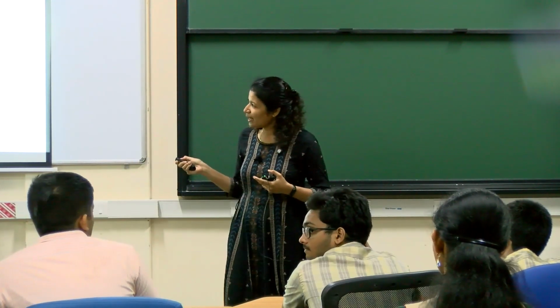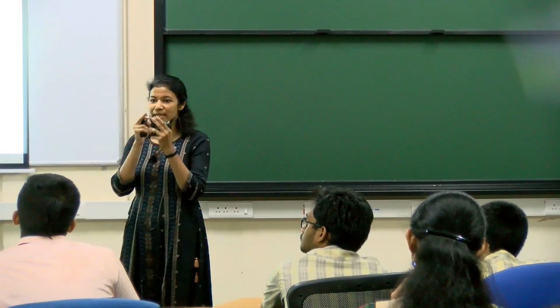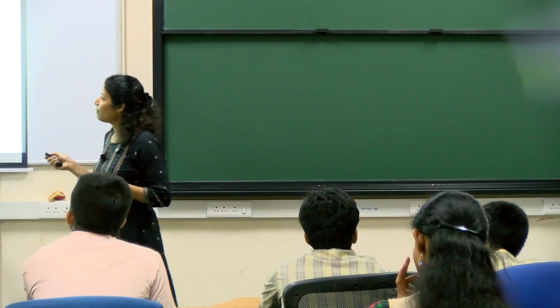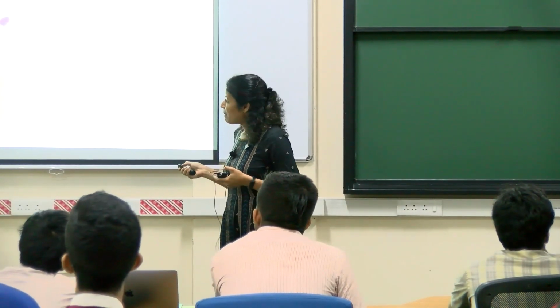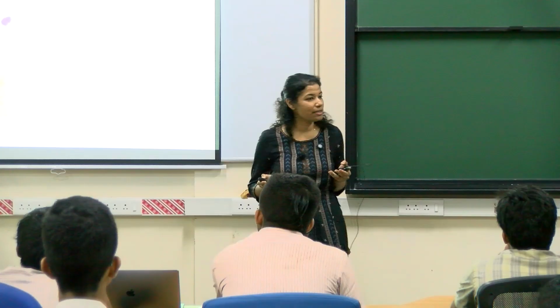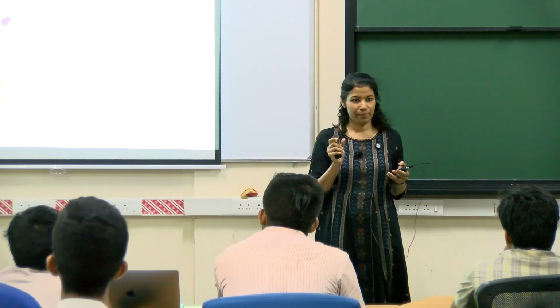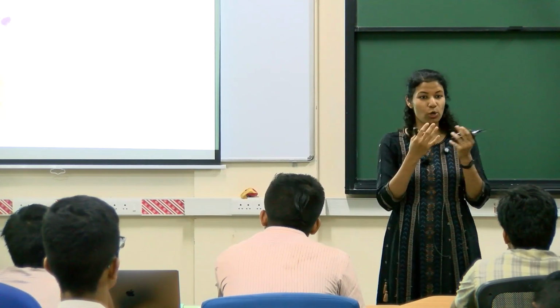So these are all in the order of micrometers. RBC is about 6 to 8 microns in diameter. Bacilli and all are about 1-2 microns. So when you see a figure like this in scientific publications and all, you will have this line. This is called a scale bar. Okay, so this is important to understand the size that you're looking at.